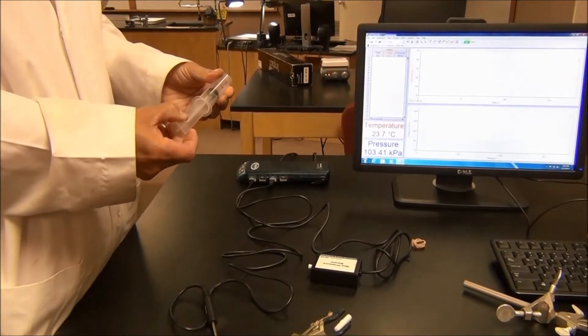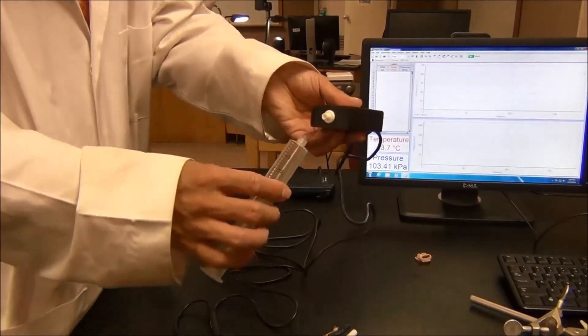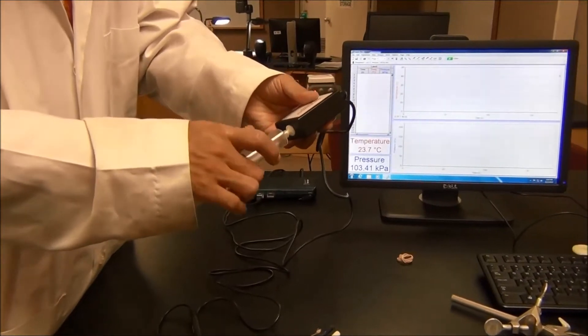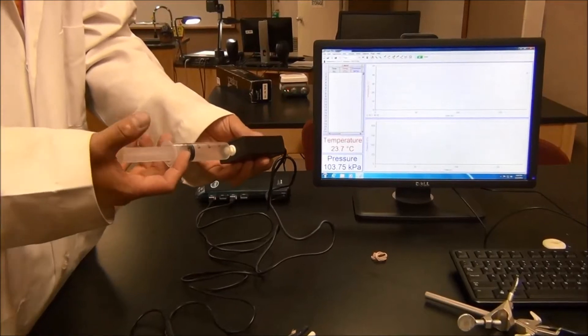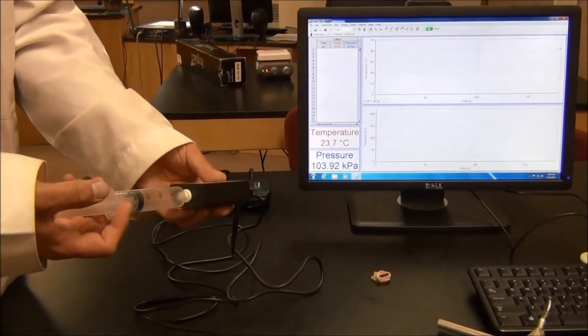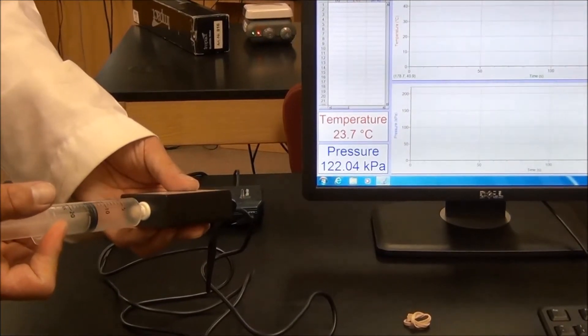To check the pressure sensor, pull the plunger of the syringe, then connect the syringe to the pressure sensor. If the pressure sensor is working properly, you should see a pressure increase when you push down the plunger — the pressure reading goes up.